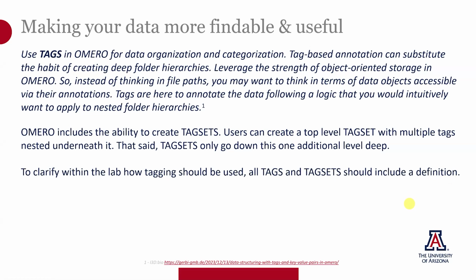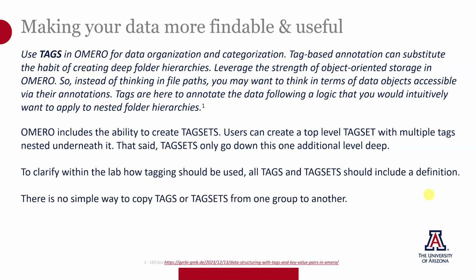The definition is to help group members understand what the tag means and how they should be applying it. It's a good idea to keep documentation on how your tags and tag sets are used. Unfortunately, tags and tag sets do not readily transfer between groups, nor is it possible to duplicate a collection of tags or tag sets to a different group, except of course doing it manually.